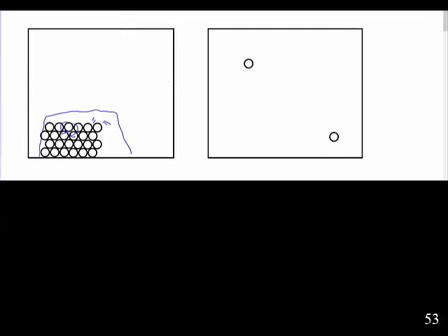So if you heat up metal, it might go red, but no noticeable difference in the volume. What your textbooks will try and do, and this is probably being generous on the textbooks, is they'll have a bit more of a distance. This is far more extreme. It just shows you how wrong the textbooks are. It's about 1,000 times difference.